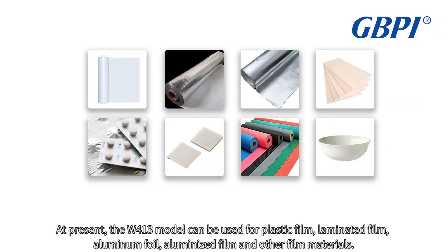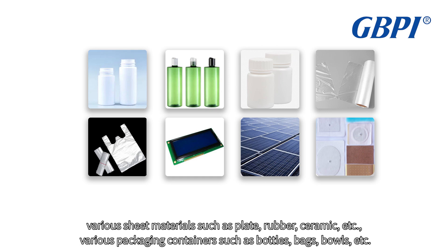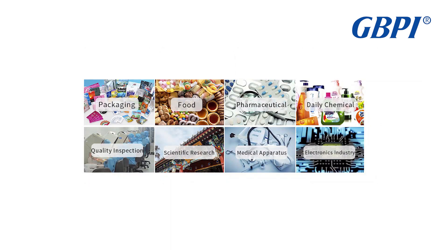The W413 model can be used for plastic film, laminated film, aluminum foil, aluminized film, and other film materials. Various sheet materials such as plate, rubber, ceramic, etc. Various packaging containers such as bottles, bags, bowls, etc.